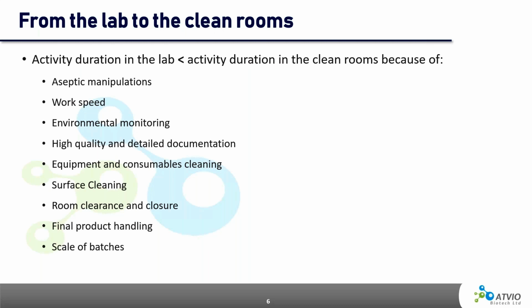When designing the process, we always need to remind ourselves to look at it from a GMP point of view. For instance, if in the lab we used to freeze a small amount of vials at the end of the process, when handling a batch in full size, it needs to go through visual inspection and labeling outside the BSC, an element that we tend to disregard in the lab. It can cause us loss of cells and impact the yield and quality of the product.